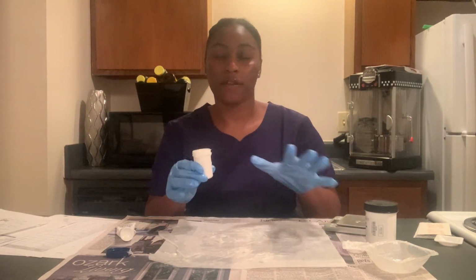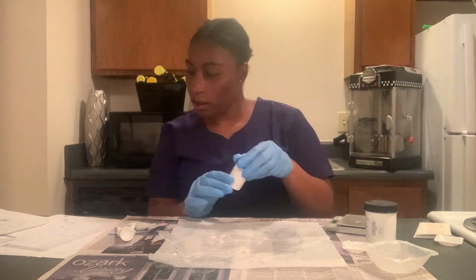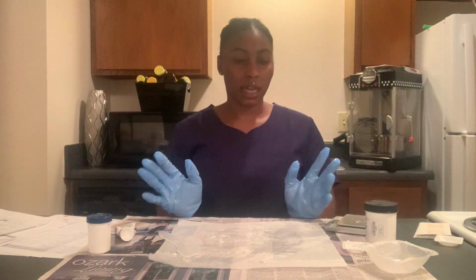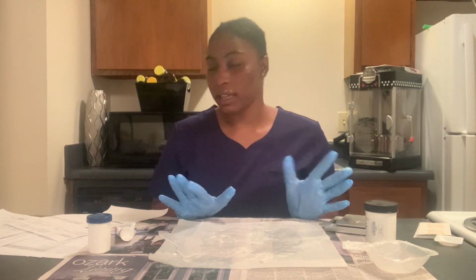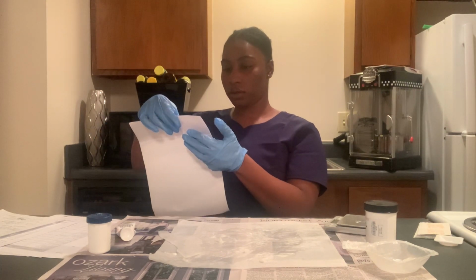Okay, so now that we have all of the mixtures together added inside of the ointment container, we are going to label the prescription. So again, in the beginning I said we are doing a prescription for Majar Davidson. So I'm going to find the prescription on here.